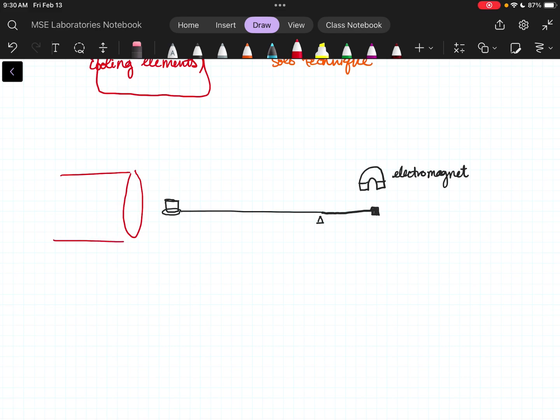So you have some position sensor in the electromagnet that just kind of hovers it, and then you read the voltage that you're pumping into the electromagnet to see, oh, hey, this is how much weight is on the thing. Precisely, yep. So what we are using to measure, quote, the weight, is how much work the electromagnet has to put in order to maintain this horizontal balance.